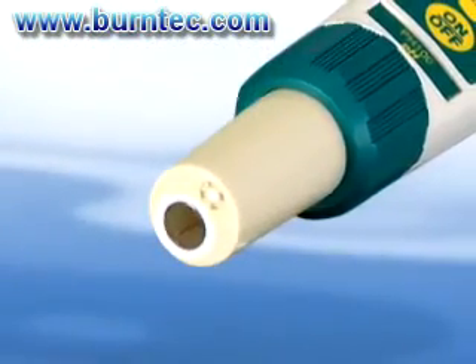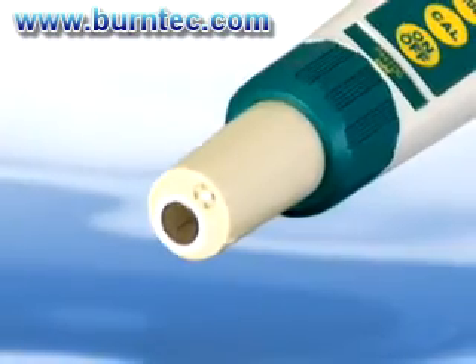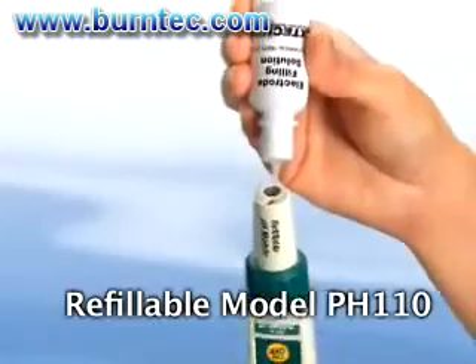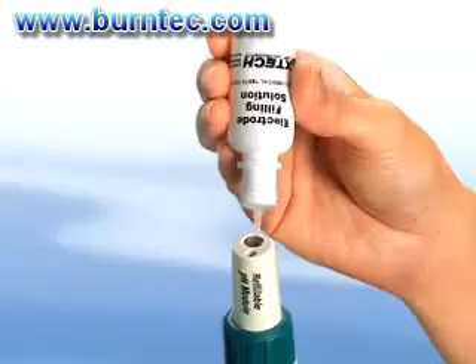This tells you that it is time to service or replace the electrode. Also available is a refillable pH electrode where you refill the reference solution once it depletes. This eliminates the concern of shelf life while offering you a continuous use of a high-accuracy electrode.